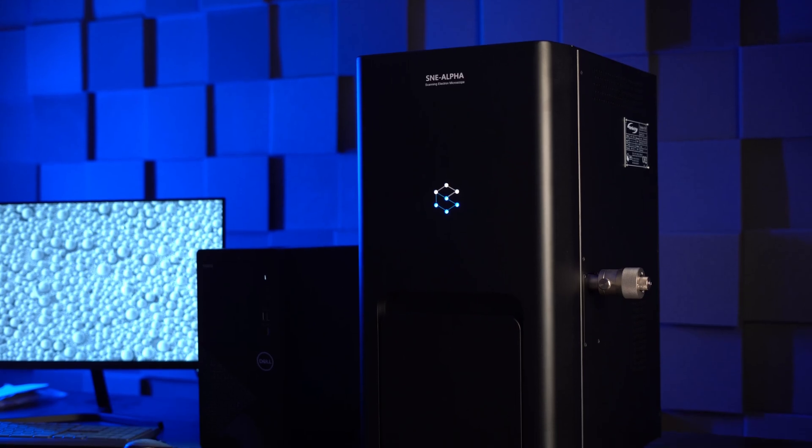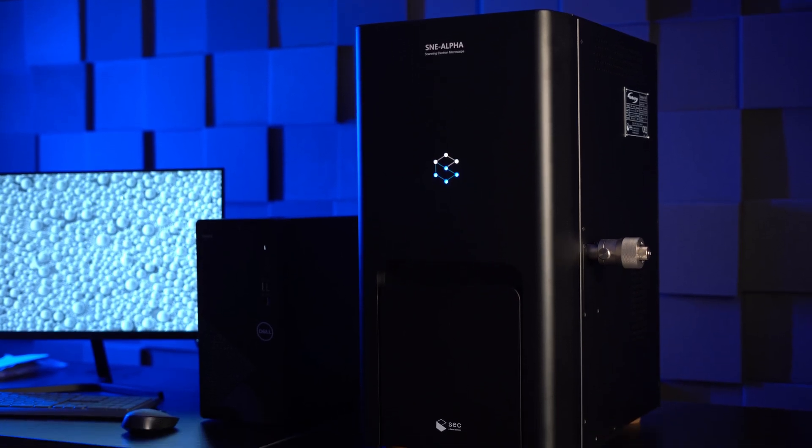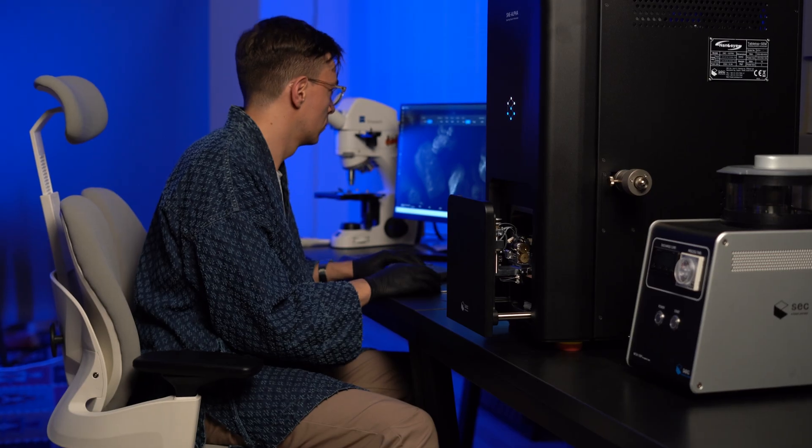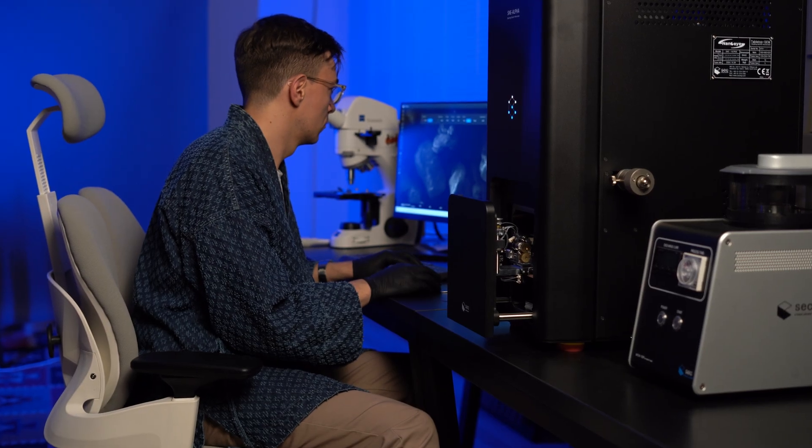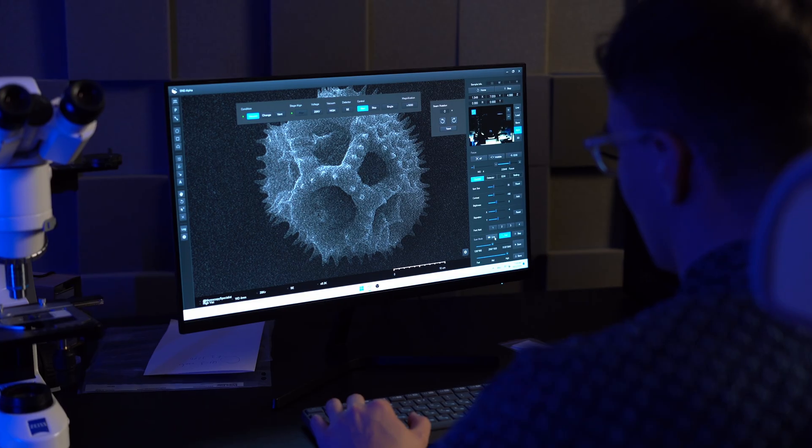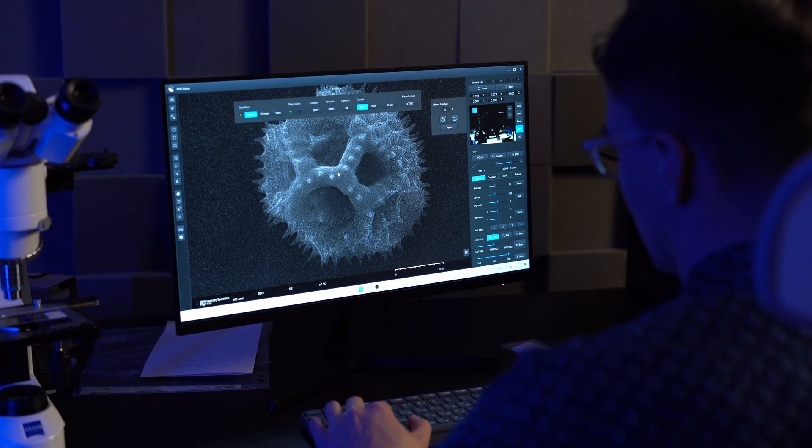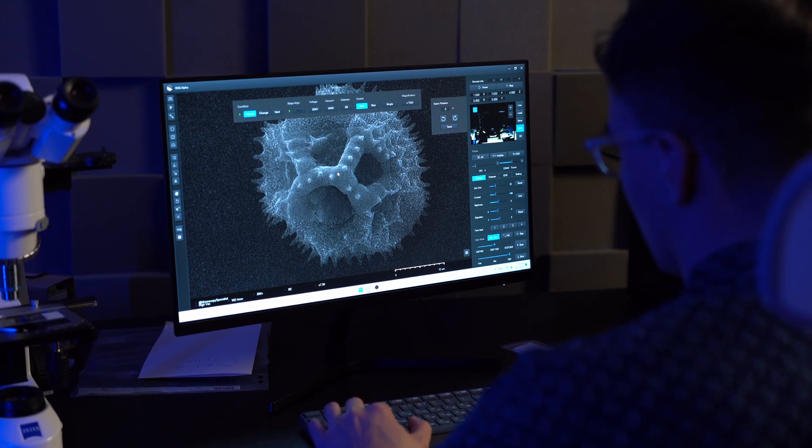Okay, here we are. This is the main unit. It's a microscope with a chamber. Today we are going to have some fun with it, but first of all let me show you what do we have inside.